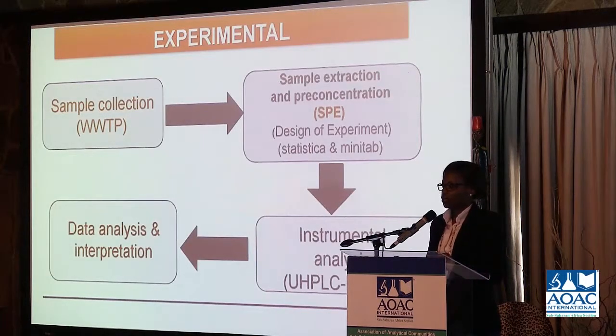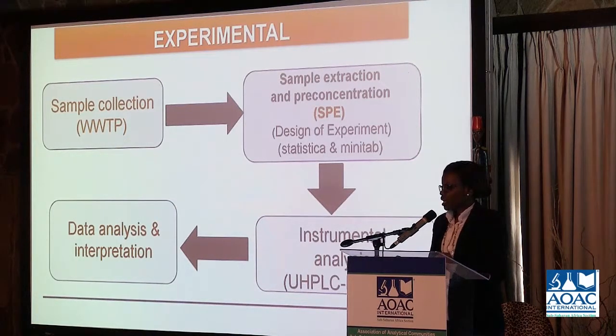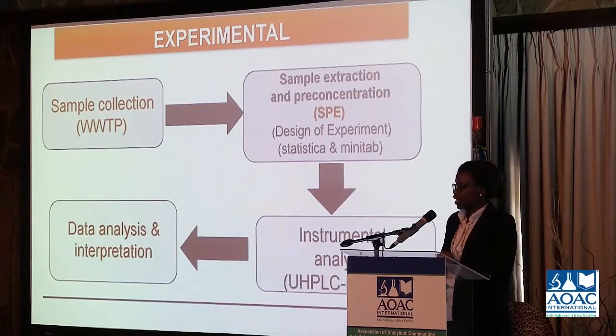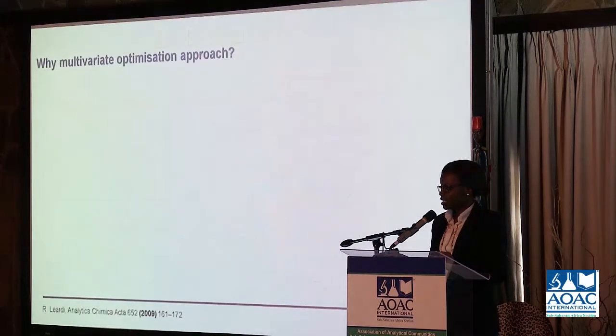So for my experimental work, we sample the water from the wastewater treatment plant because I'm focusing on wastewater. Then we analyze them using various extraction techniques. Professor Dube mentioned quite a variety of techniques yesterday. And for this work, I'll be using solid phase extraction. For the solid phase extraction optimization, I use design of experiments using Statistica and Minitab software. Thereafter, in conjunction with analysis using LC-MS/MS, you analyze and interpret the data.